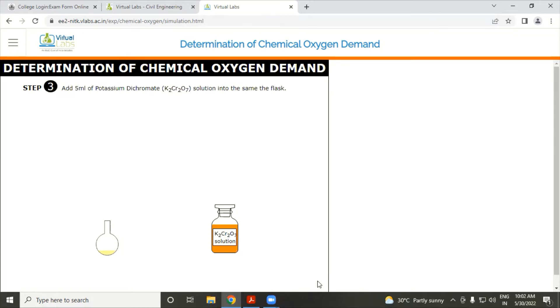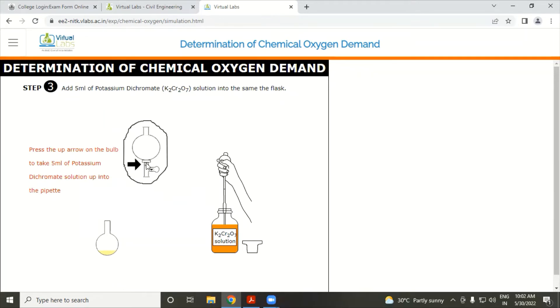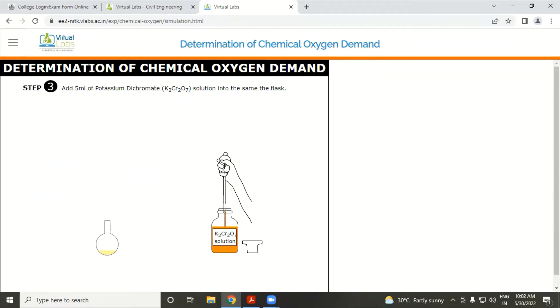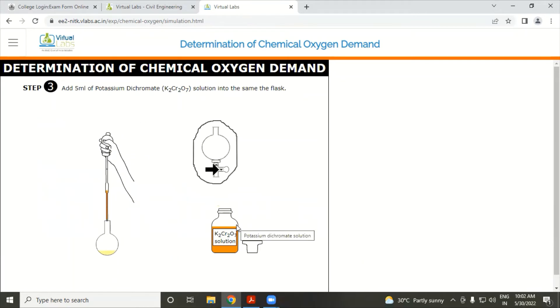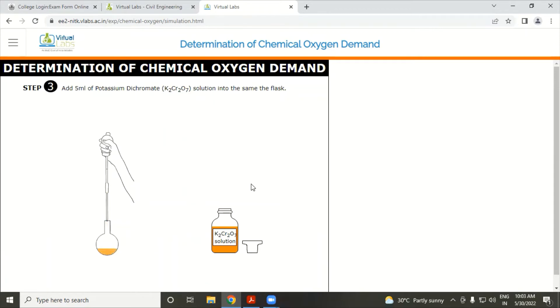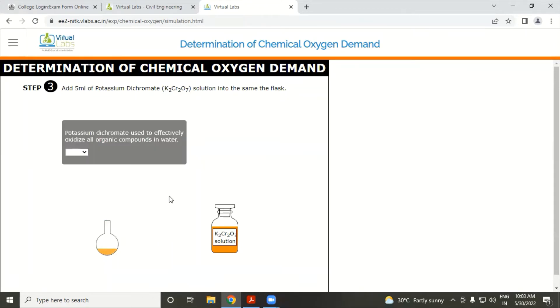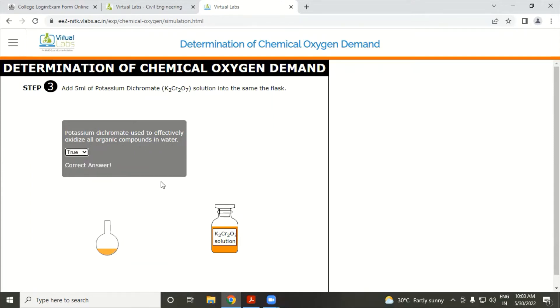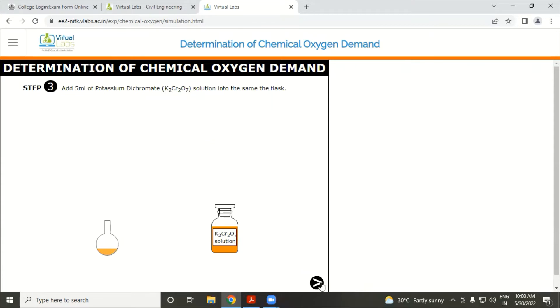Add 5 ml of potassium dichromate solution into the same flask using a pipette. Question: Potassium dichromate effectively oxidizes all organic matter — true or false? The answer is true. Answer is correct.